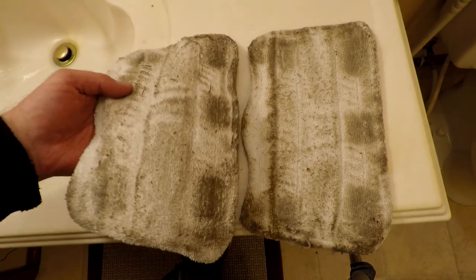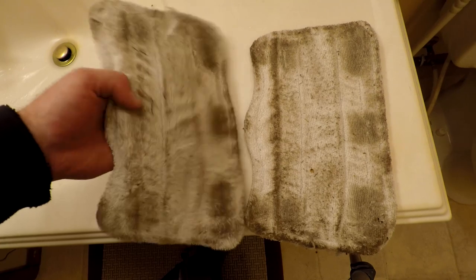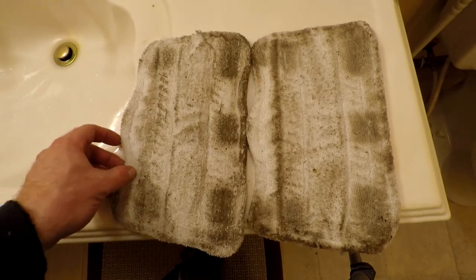See how dirty these pads have gotten? That would have all been mold and bacterial contamination.